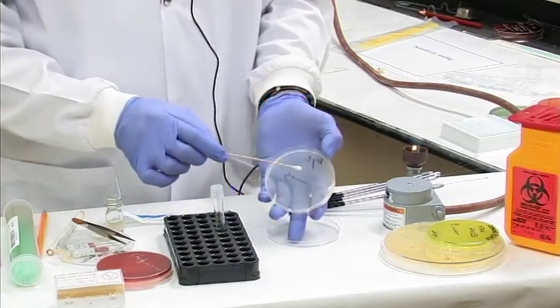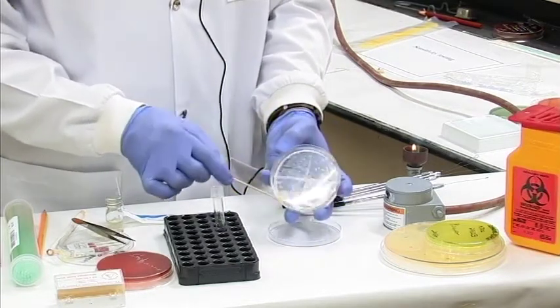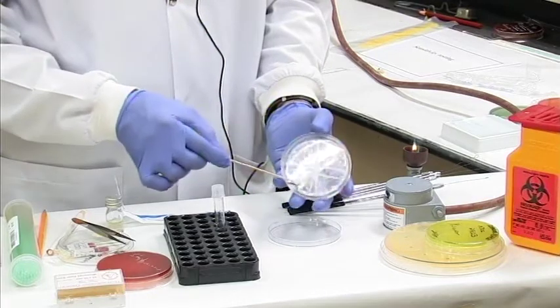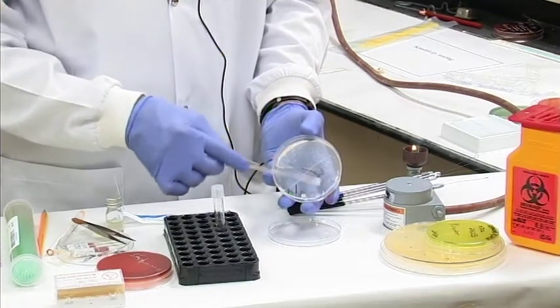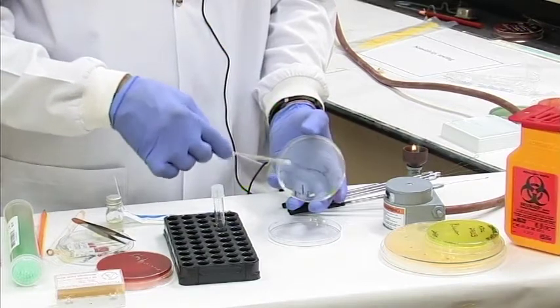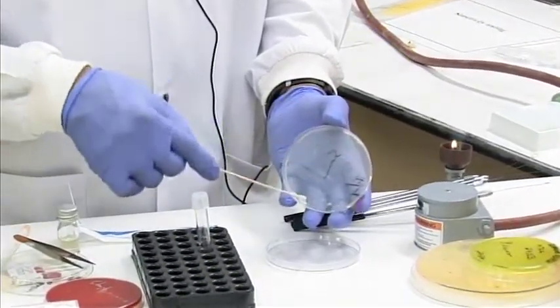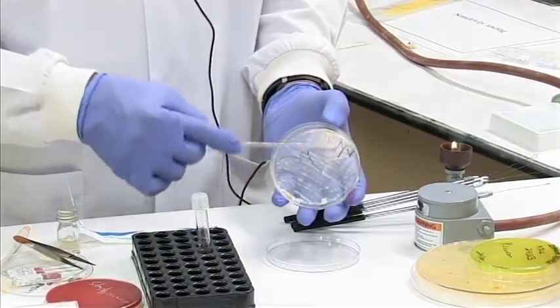But we're going to use a different streaking pattern here. We're going to put it across one way, turn the plate 45 degrees across one way again, and a third way as if we're cutting a pizza to create slices. After we place that in that fashion, we're going to start from one portion of the plate and streak it by rotating the swab, moving it across the plate without leaving any spaces. Then we're going to turn the plate 80 degrees or so. Do the same thing across the entire plate while rotating the swab. So what we're doing here is basically spreading out the inoculum of bacteria onto the agar plate.